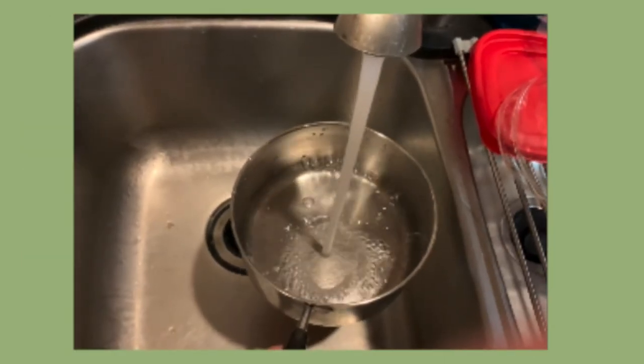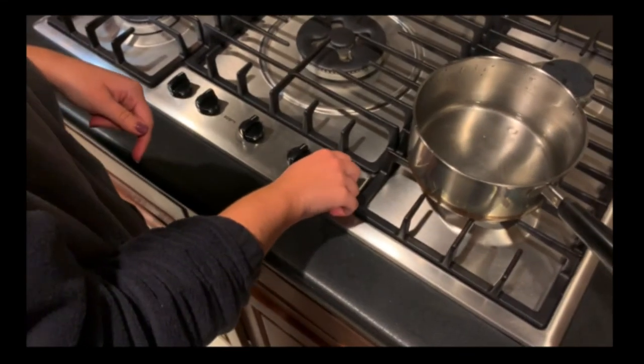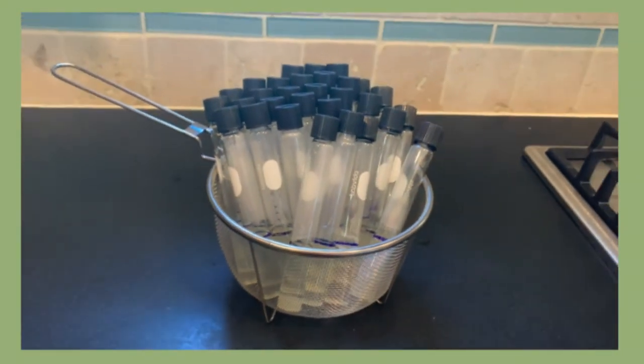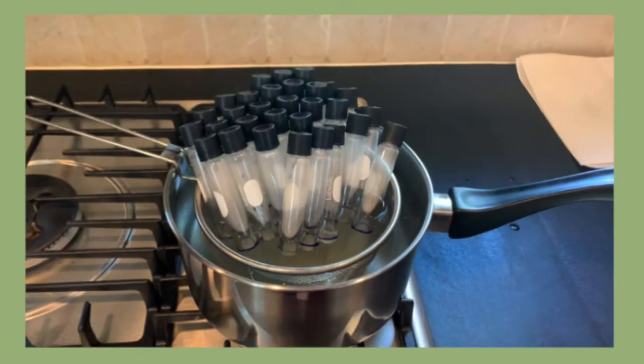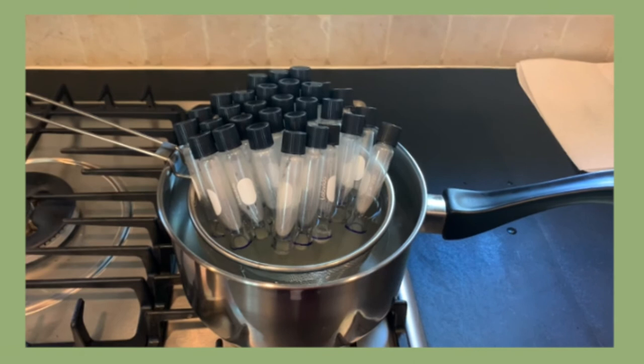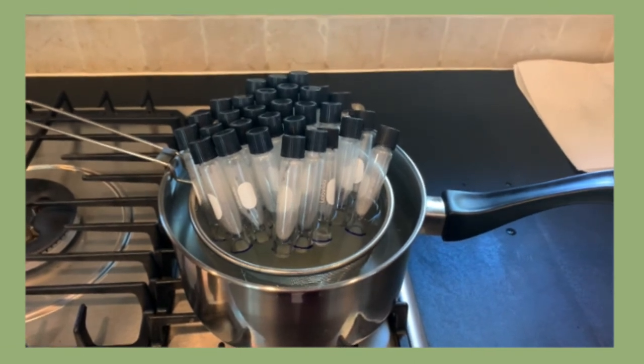Fill a pot with approximately 3 fourths full of water. Set the water on the stove to a boil. While waiting for the water to boil, put all filled culture tubes into a colander. Place the tubes in the colander in the boiling water for 20 minutes. This step serves to sanitize the medium and the tubes.